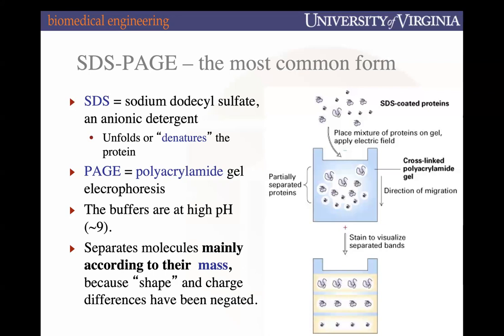Typically, a rule of thumb is you can tell if someone's working with beta-mercaptoethanol because it smells like rotten fish. It smells terrible. But it's a really potent reducing agent that's able to break the disulfide bonds and further denature the protein. And so 3 key denaturing steps that we typically use for SDS-PAGE are heating, the presence of SDS, and reducing agents to break disulfide bonds.